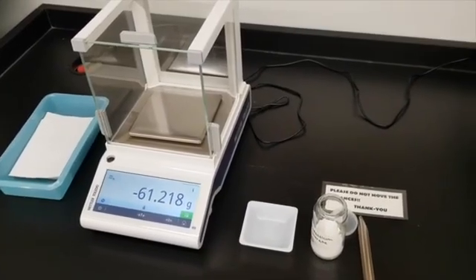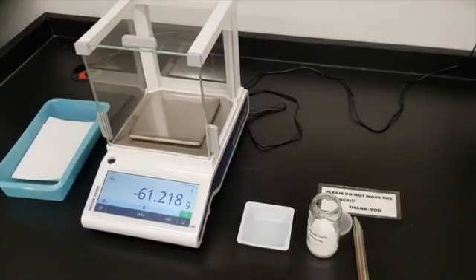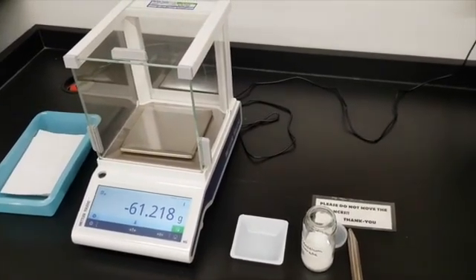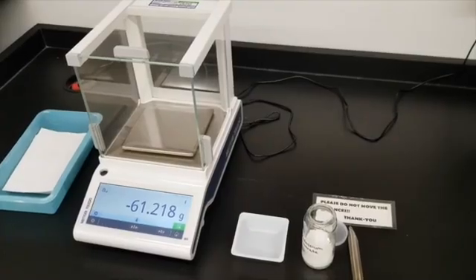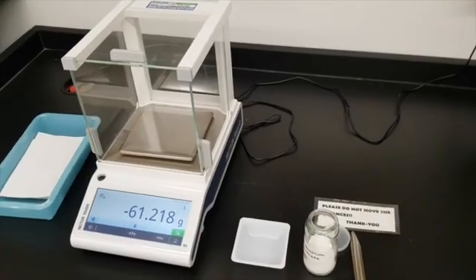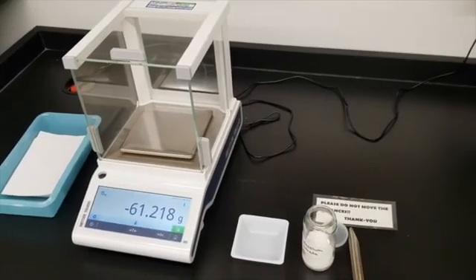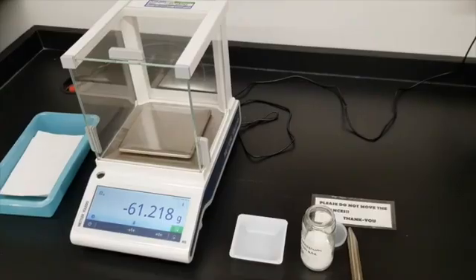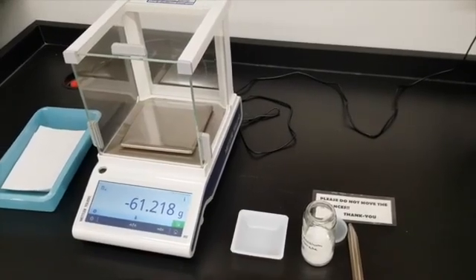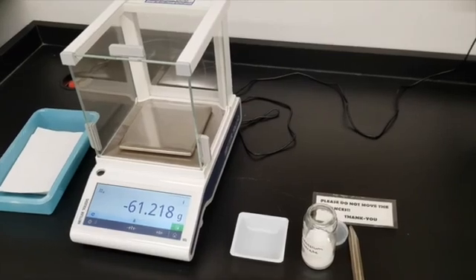So we're going to take various amounts of potassium nitrate. I'm going to demonstrate this with one run, and then I will provide you with some other student data. This is how we'd actually run this if you were present in lab. Typically, we do this as a group experiment where different lab pairings each do a trial run, and we pool everyone's data together.